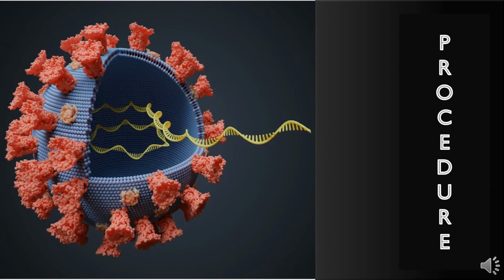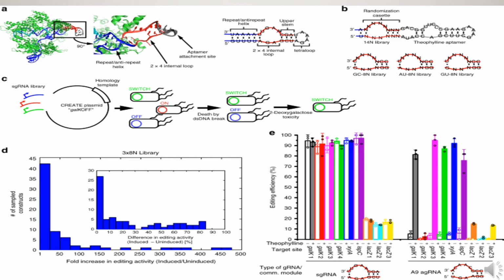We will prepare the CRISPR reaction according to the table given. Once we have prepared your CRISPR reactions, make sure to label your plates so we remember which cells we spread on which plate. When we are done, we will make sure to inactivate our modified bacteria with 5 to 10% bleach before disposal. This is the pictorial representation of the procedure.